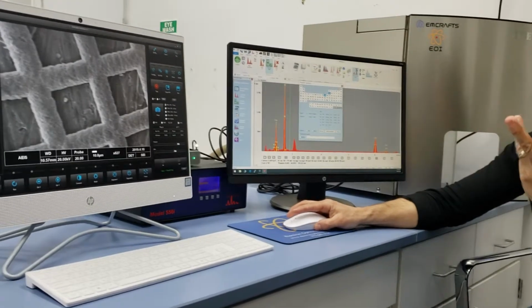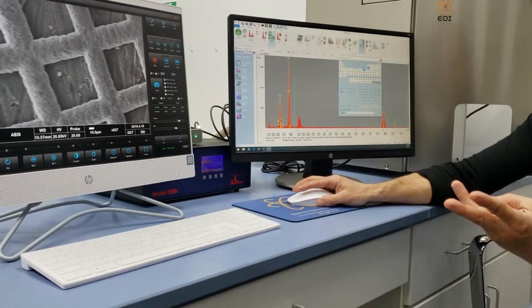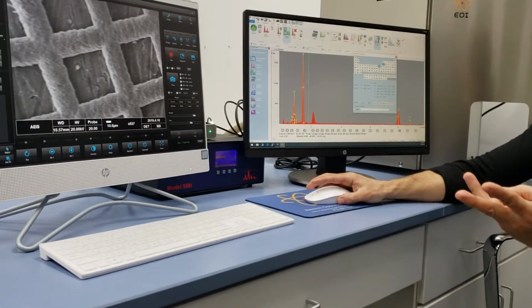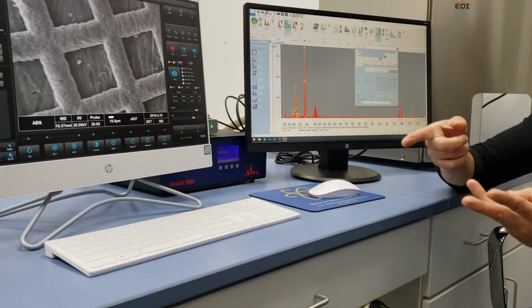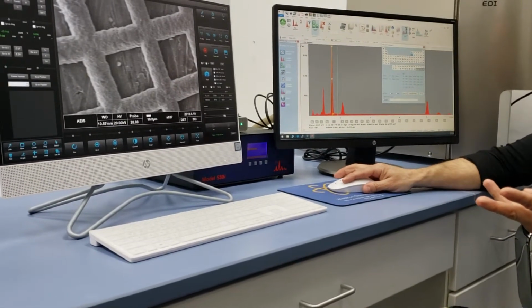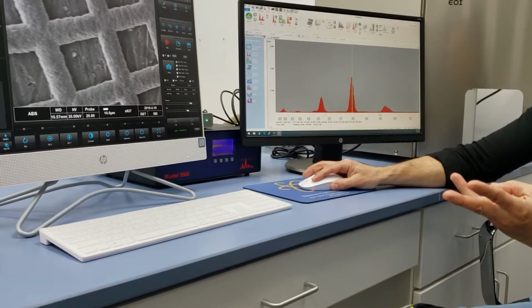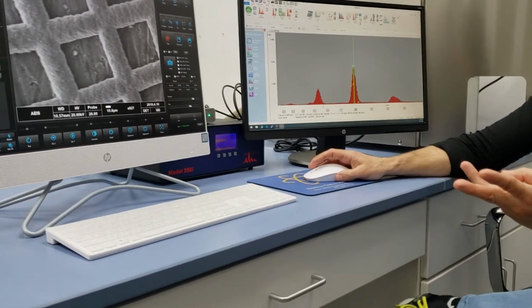The third way of labeling is, you see that there's elements listed down here at the bottom of my spectral window? These are K alpha buttons. So if an element has a K alpha line associated with it, it'll have a button. So if I come in through here and I unlabel this, and I grab my spectral window and I separate this element, this peak, and I click on that button, it labels aluminum. There's a K alpha button.